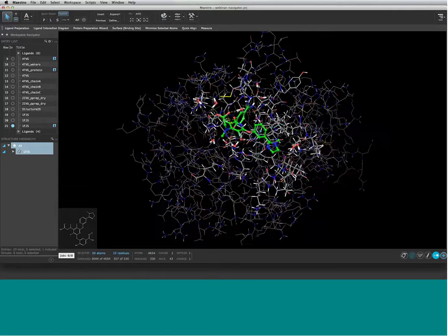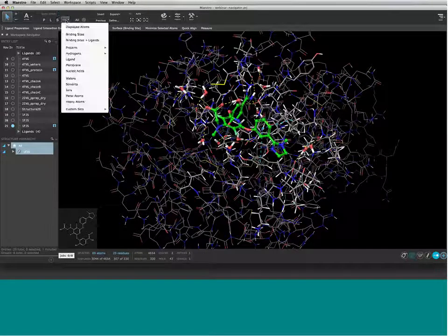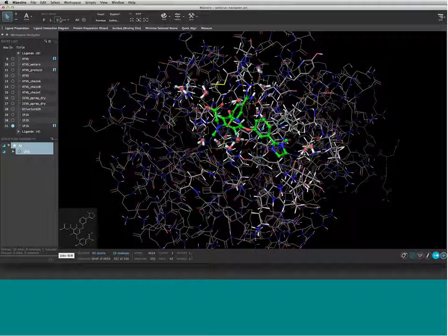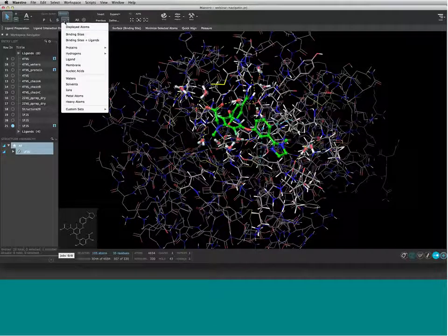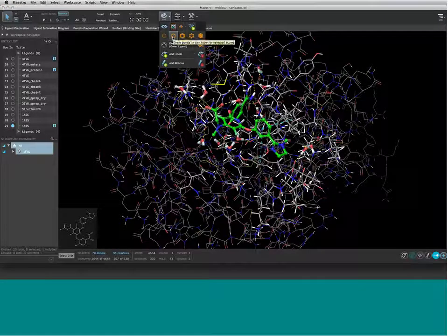And then one final example. Now I have my hydrogens showing on my waters, but they look a little heavy. Maybe I want to make those thin too, but just the hydrogens, not the whole water. So how would I do that? First, let me select my waters. And then I'm going to remove the oxygens from my selection, which in this case is heavy atoms. So now I can style just the hydrogens with thin tube.